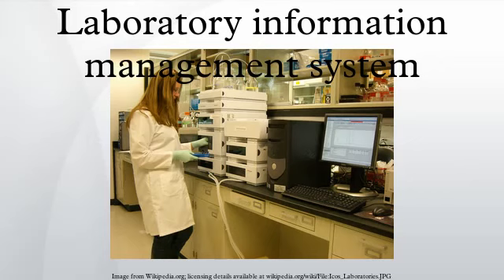Thick client. A thick client LIMS is a more traditional client-server architecture, with some of the system residing on the computer or workstation of the user and the rest on the server. The LIMS software is installed on the client computer, which does all of the data processing. Later it passes information to the server, which has the primary purpose of data storage. Most changes, upgrades, and other modifications will happen on the client side.